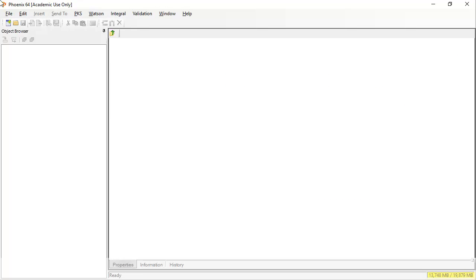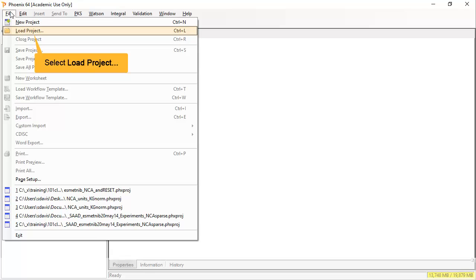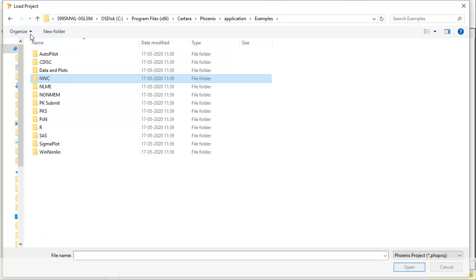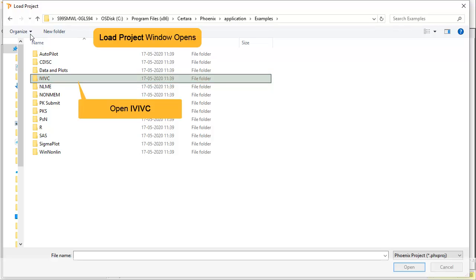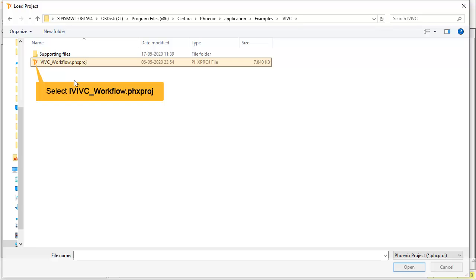When first opened, the Phoenix workspace is empty. To get started, one can either load an existing project or create a new project. In this tutorial, we will load an existing project that is shipped with the software. Browse to the examples folder and open IVIVC, then select the IVIVC workflow project.